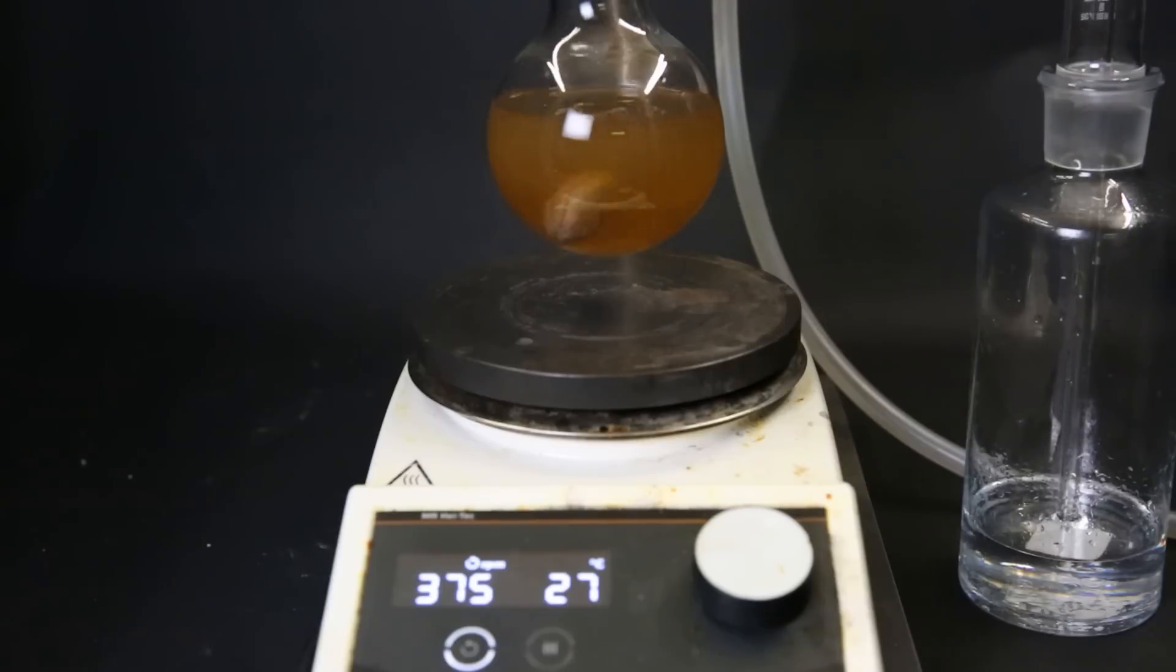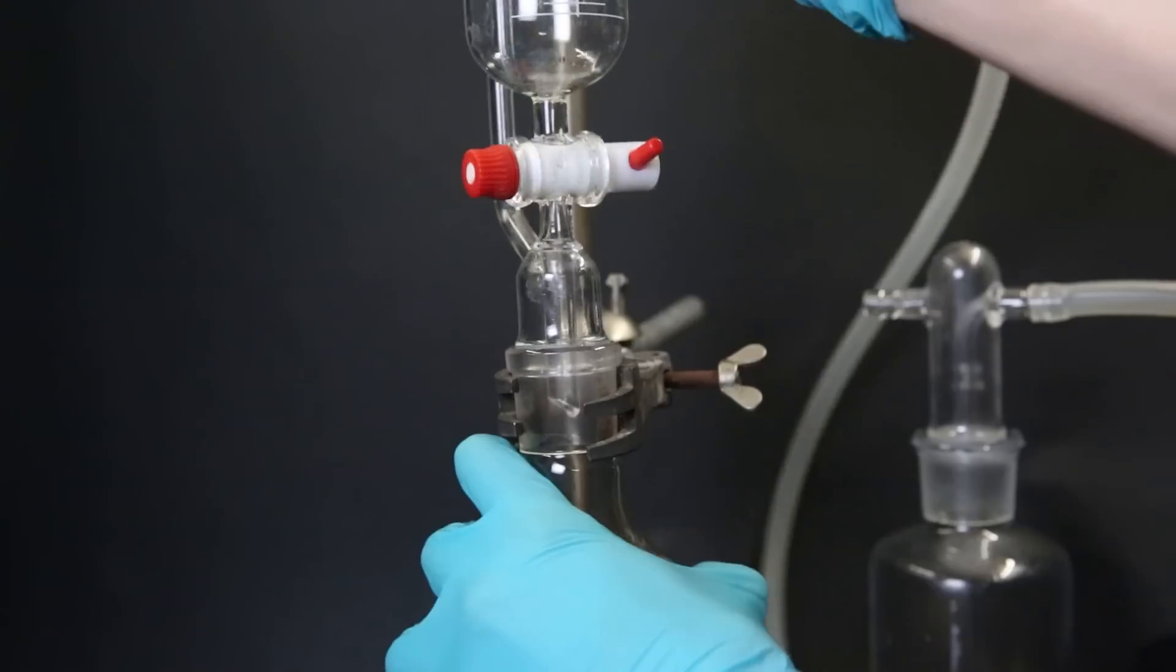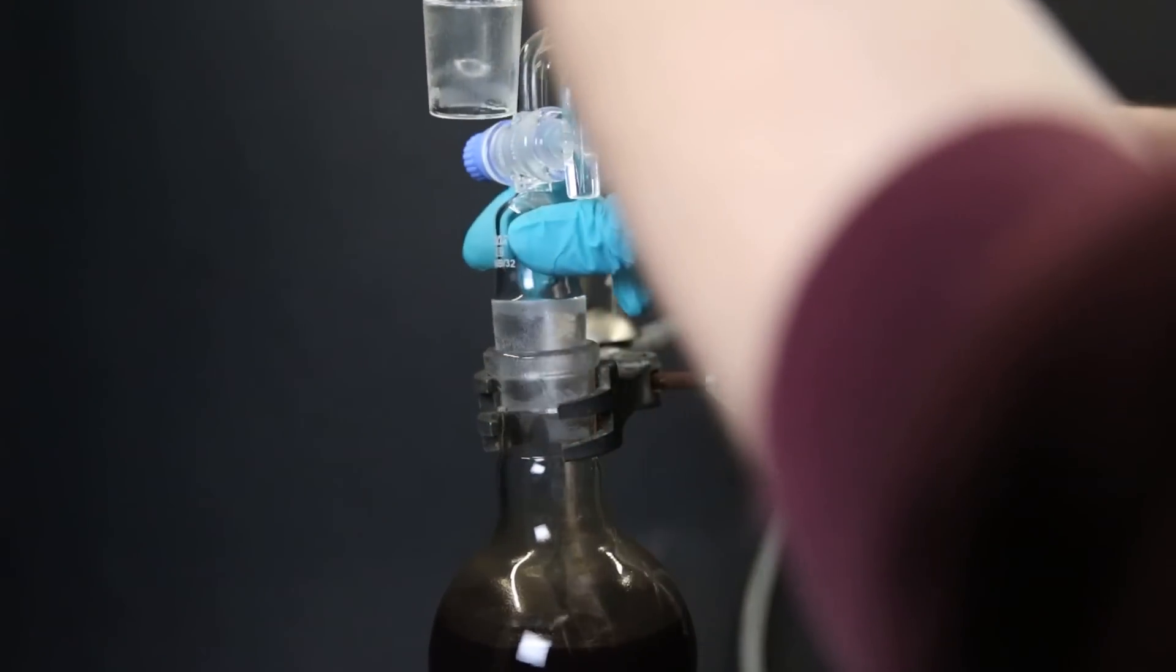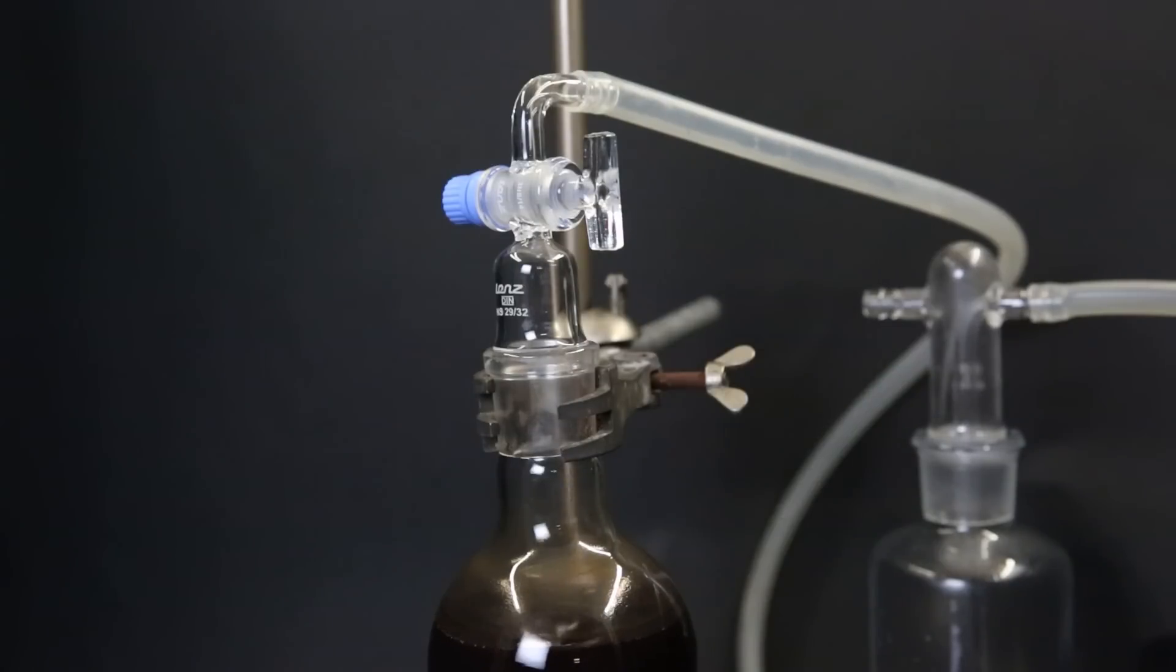Since the surface area of the sodium pieces is quite small, it will take a while for the reaction to complete. After all of the cyclopentadiene is added, I remove the dropping funnel and connect the flask directly to the gas washing bottle. I then let it react until no more hydrogen is produced and all of the sodium is gone.